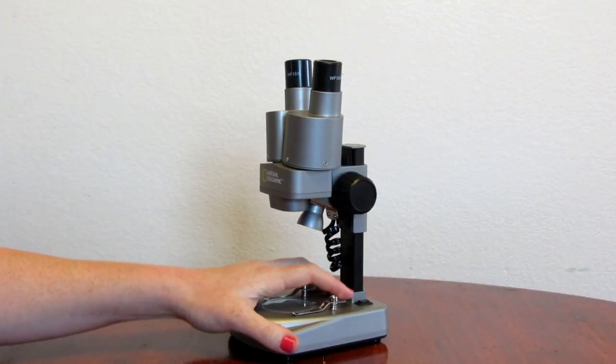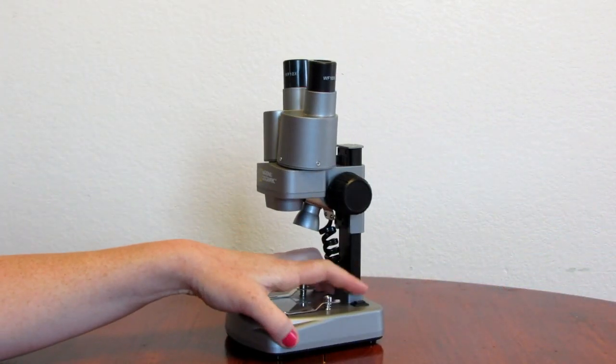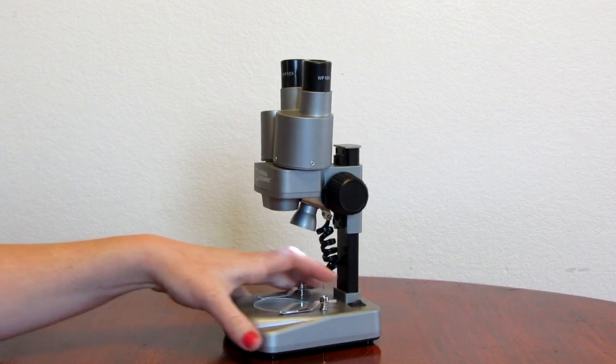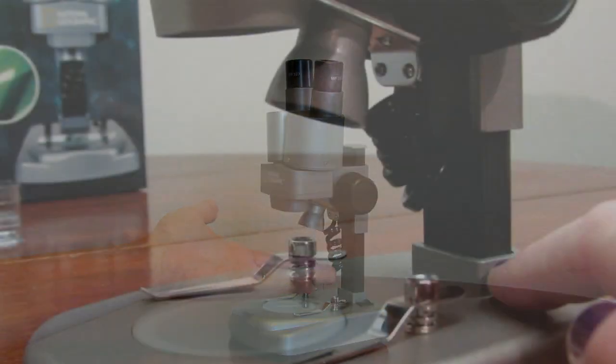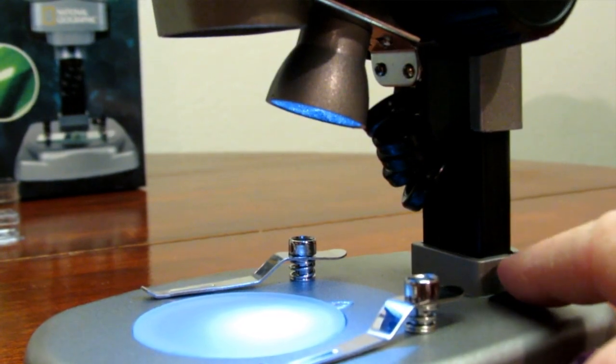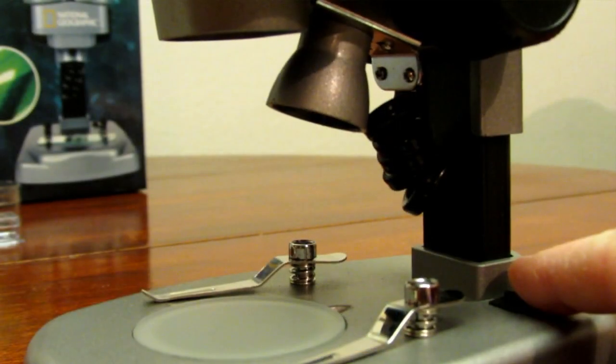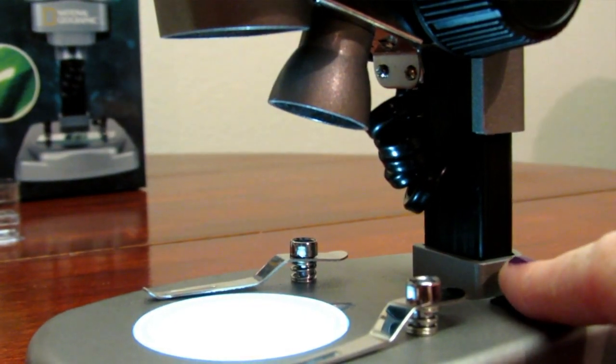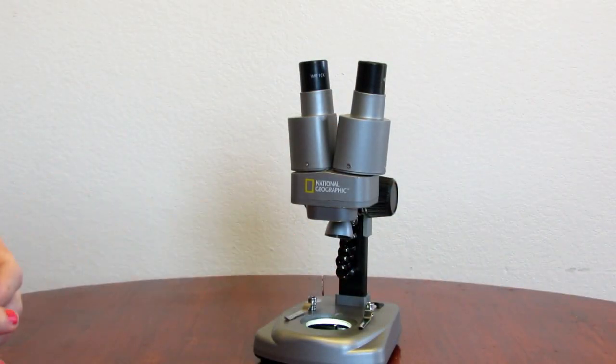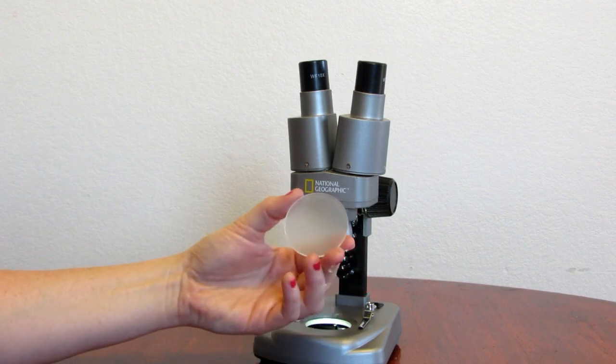On the other side is where you have your light switch, and you can see the light from above so you can visualize the specimen, or you have it from below with this condenser lens right here.